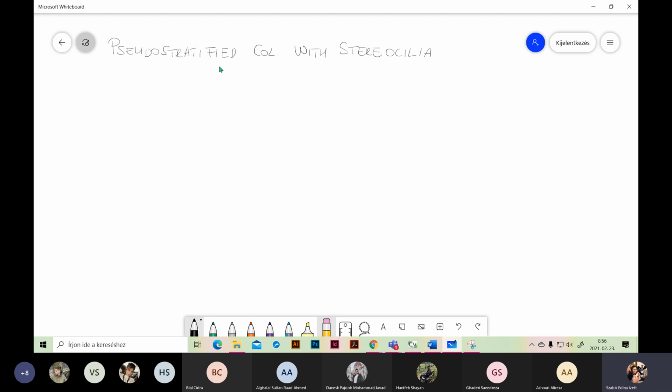Okay, and the slides from the epididymis, which belongs to the male genitalia. We have two different slides with two different staining methods. The first one is stained by hematoxylin eosin, and the second one is stained by Azan staining. The epididymis slide is more complicated because sometimes you can see other organs in the slide.